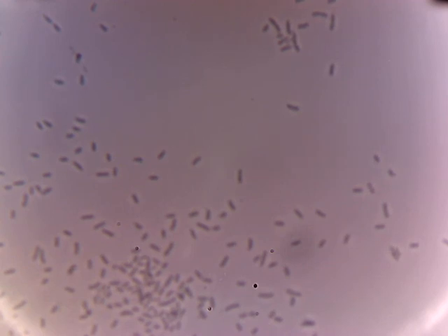Out toward the middle of the slide where the big colonies are of these non-moving bacteria, there are very few of these. They're all hanging towards the edges. There are a lot of them, actually. If you were to do a population count, I think you'd be quite impressed. It's hard to get them in focus because they move so quickly, and of course they're using the full depth of the fluid on the slide. So you can't really ever get them to hold still — even when they get stuck, they still really tend to flick around a lot. It's hard to get a good look.